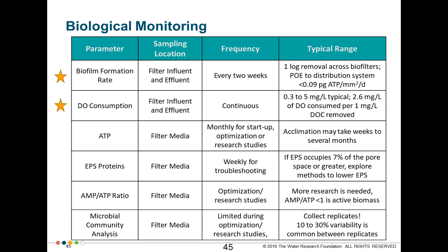Okay, thanks, Christina. So again, the focus of this project was to provide guidance on practical tools for operators for use on biofiltration monitoring. So some of these tools that we discussed may have application in research studies or potentially in optimization studies or troubleshooting, but for practical use, especially for regular, normal process conditions, there's some key tools that we recommend for monitoring. The first is the biofilm formation rate and for biological monitoring, and DO consumption.